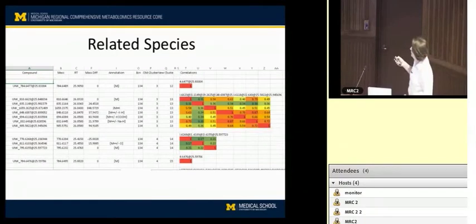But we're also seeing in a lot of places that there are related ions that we can start to look at as well. So if I identify this one and then figure out that this one just has an additional oxygen in it somewhere, a hydroxy version of this or something like that, then that's more chemical information I can use to identify both of these together.